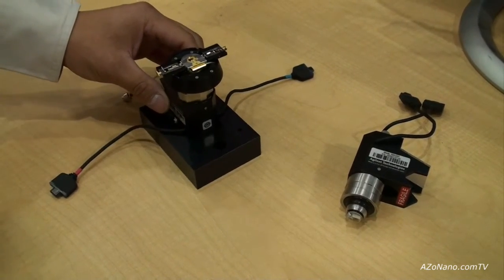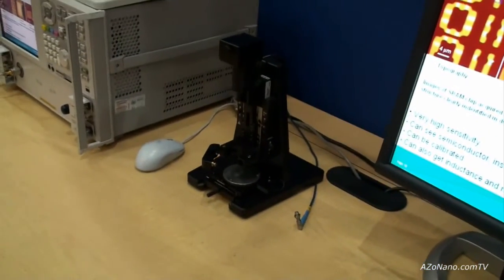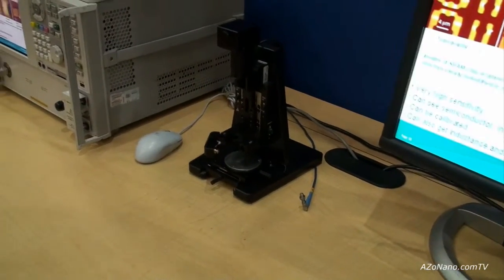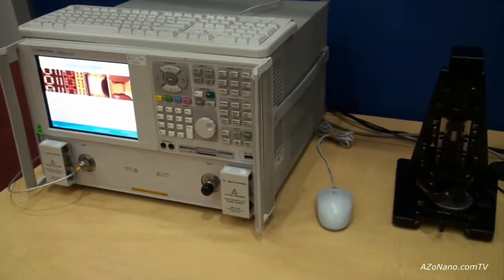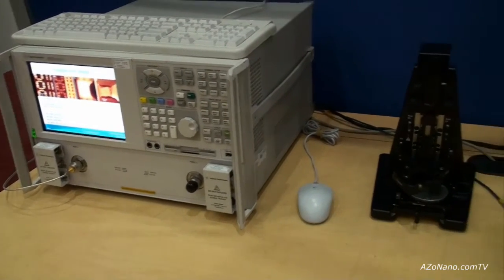This technique and accessory will fit onto the 5400 AFM or the large stage 5600 AFM. The other key component of the accessory is the network analyzer — another one of Agilent's core competencies — interfaced with a simple coaxial cable to the nose cone scanner.